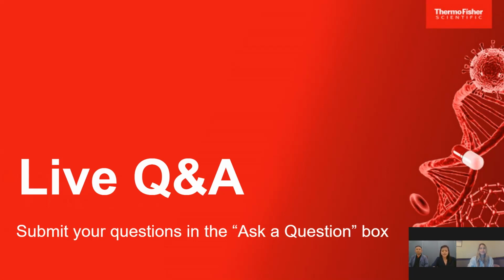So that's a great question. I went through labeling as well as staining earlier. So labeling, like in the context of the no-stain reagent that I mentioned that we have for total protein normalization, works by forming covalent bonds with the lysine amino acid residues, which is the most abundant in protein.